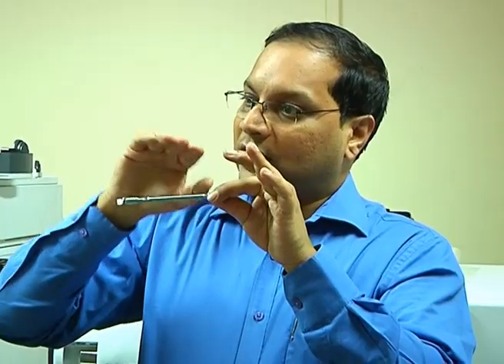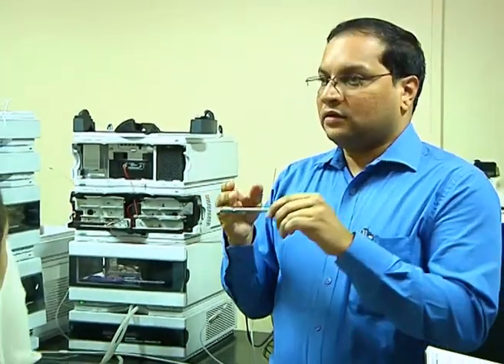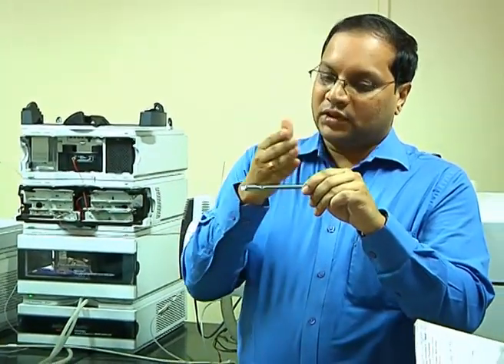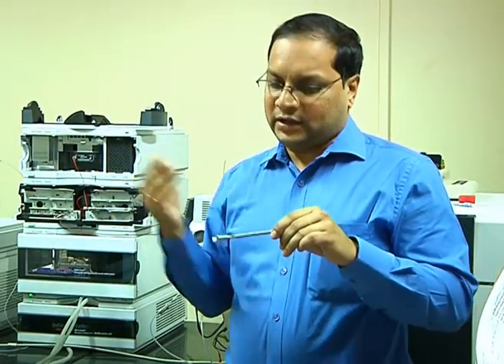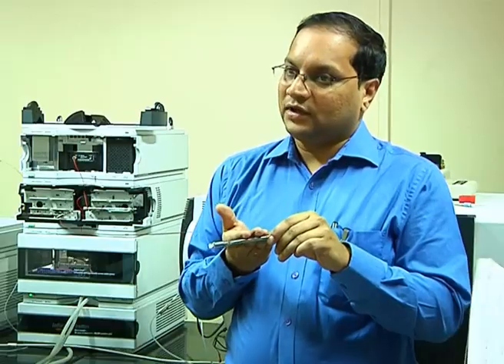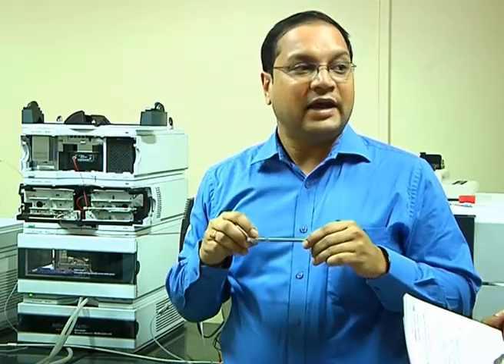You slowly increase the organic content and reduce the aqueous content, so that the polarity is changing, and depending upon their binding capacities, they will cleave off from this and then start eluting. Okay. If this is so, it means I can measure the peptides at UV itself. Why do we need MS? Anyway, it is retaining everything, and eluting also, and you can measure it in UV also. Then why do we need the MS?